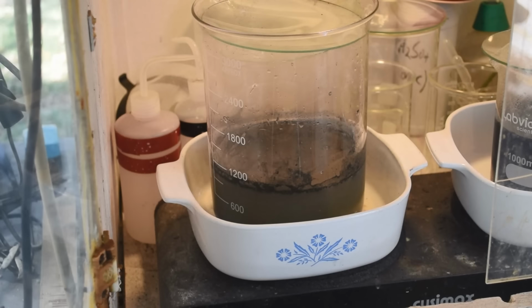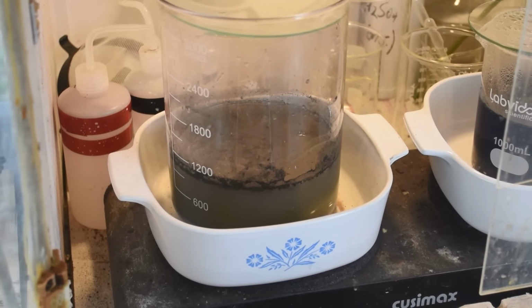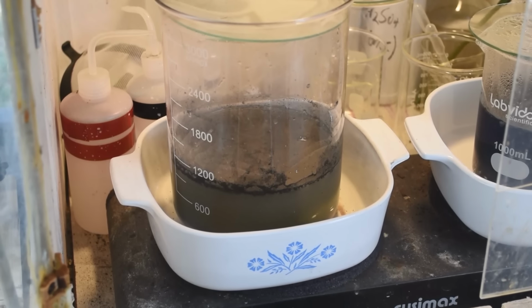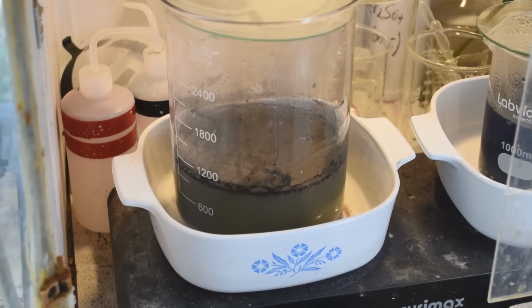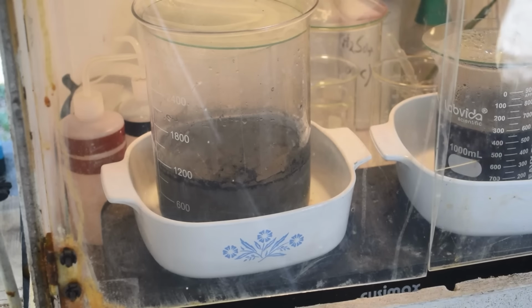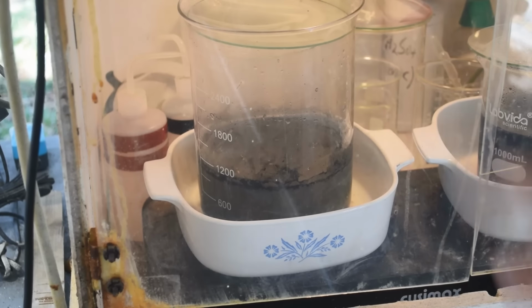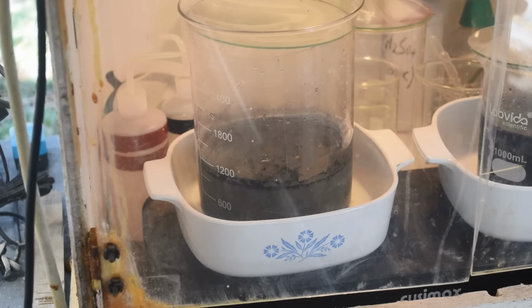Now, this has only been on the heat for a few minutes. It's not really even very hot yet. I don't know if that's showing up on the video very well, but the liquid has turned sort of a sickly yellow-green color. So we're definitely dissolving some base metals out of this liquid. We got some bubbling going on. That's not boiling. That's hydrogen from the base metals reacting with the acid in there.